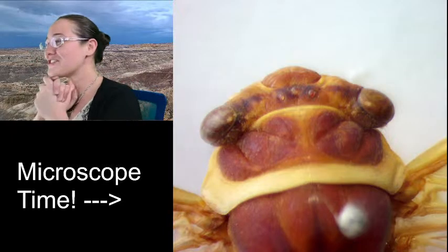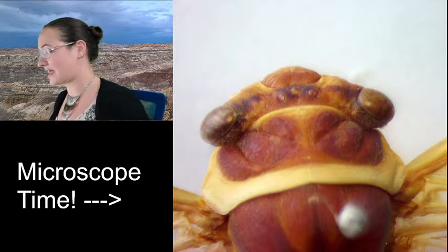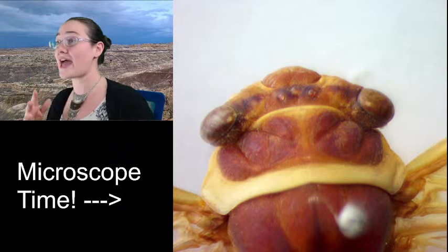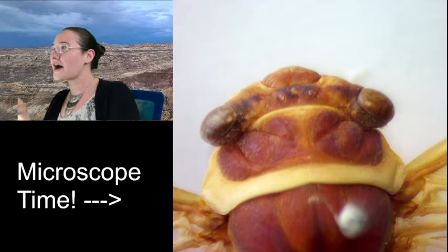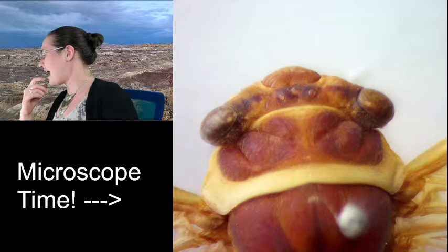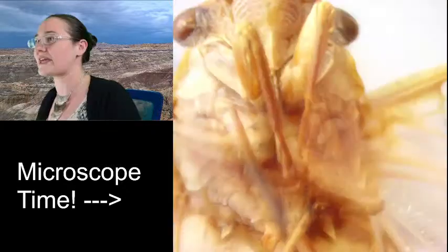All right. So, we have those cicada. We got the cicada taken care of. We got to talk about its body parts. We did look at it head on, although I didn't have a chance to really sketch it head on. Maybe you guys did when we were looking at it. We could flip it over and look at the bottom of its head, because the bottom of its head has its long piercing and sucking mouth part. So if we wanted to check that out, we can.